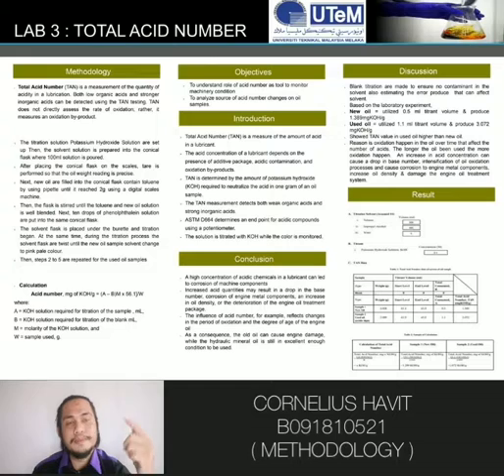As I mentioned before, this step we must do carefully because the presence of air around the digital machine will affect the weight of the new solution. Then the flask is stirred until the toluene and new oil blend. Next, we need 10 drops of phenolphthalein solution poured into the same conical flask. The solvent flask is placed under the burette and then the titration begins.